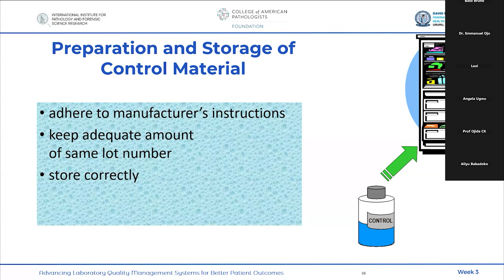And our lab, through the laboratory information management system, is linked to the head office, where every activity of yours is remotely monitored. Meaning they want to know when your equipment maintenance was done, when your quality control was assayed, what results you have. So it's a real-time tracking.